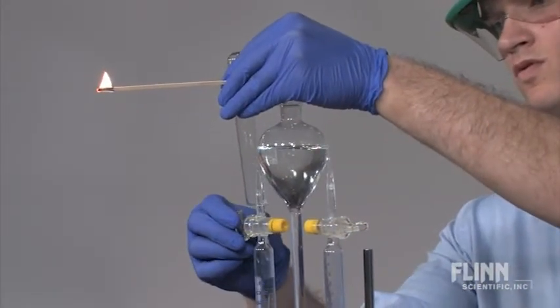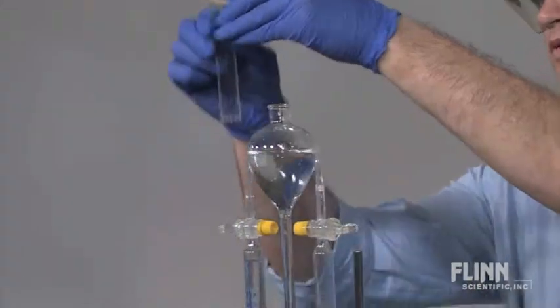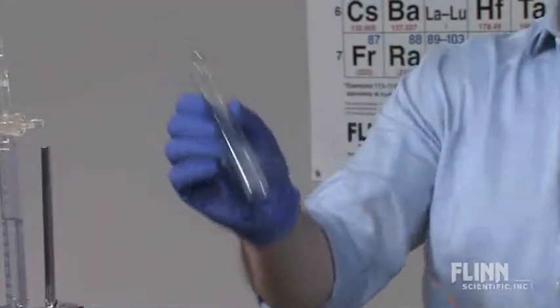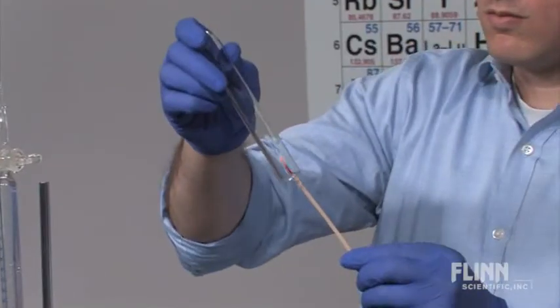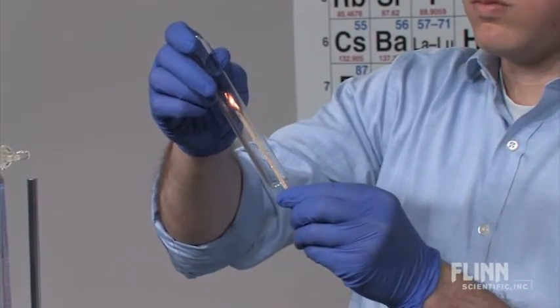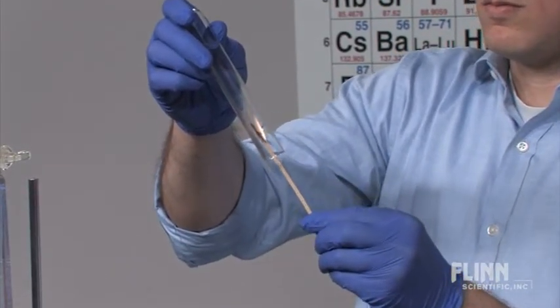Prove that you have just split water by inserting a burning splint into the hydrogen test tube. Insert a glowing splint into the oxygen test tube and the nearly extinguished flame will spark back to life as the oxygen gas fuels its combustion.